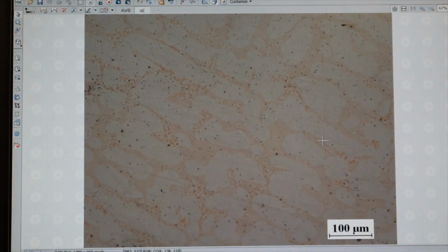So this is a much different microstructure. You see we have lots of this silver background. So this is our beta matrix. And inside we actually have this orange matrix, which when you look at it, looks like probably just alpha. But that is why we take magnifications at two different magnifications. We take one at 20 and one at 50. So let's zoom into 50.